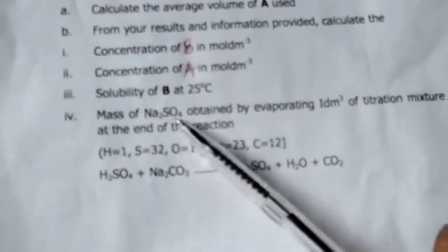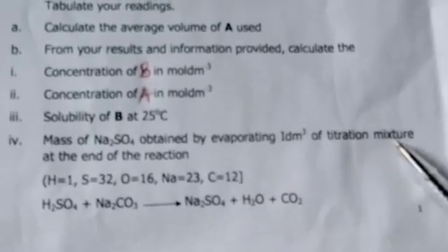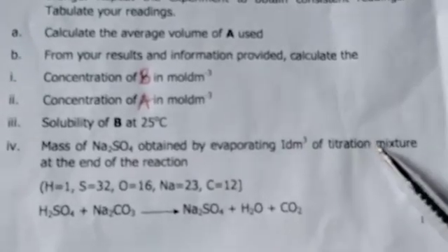So now go to question IV that says: mass of sodium sulfate obtained by evaporating 1 dm cube of titration mixture at the end of the reaction. So let's go to the board.